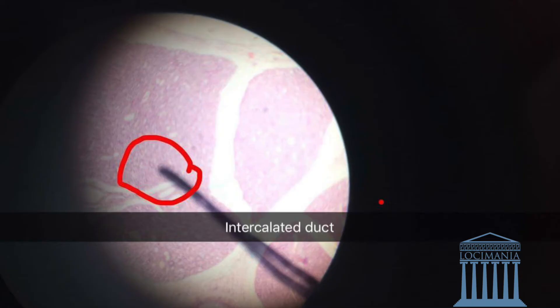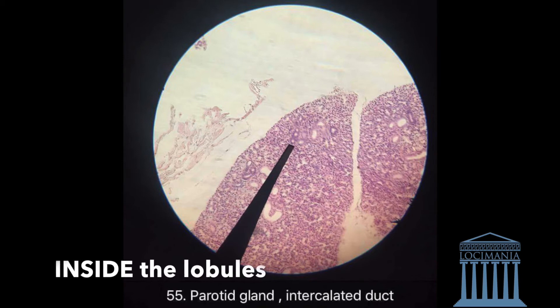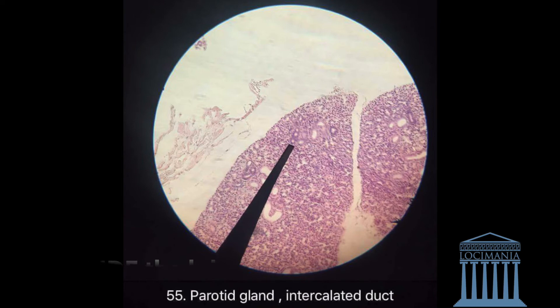Going on, we have the intercalated duct. They are small and pinkish and they're within the lobules. This is a very bad specimen, so I'm going to show you a better one. That is the intercalated ducts — as you can see they are intercalated and inside the lobules. They are small and pinkish.